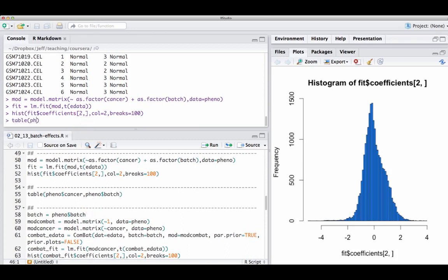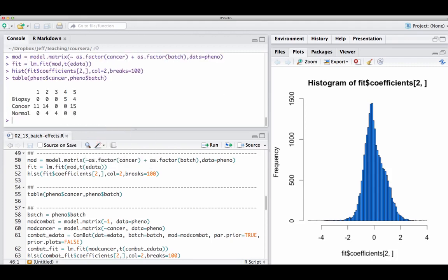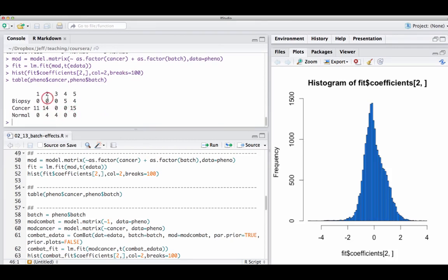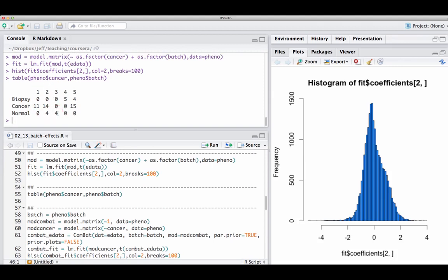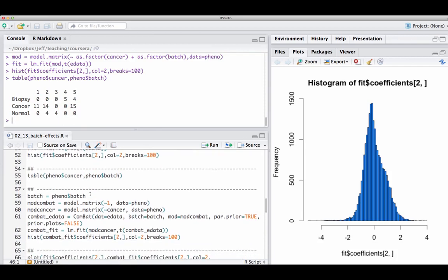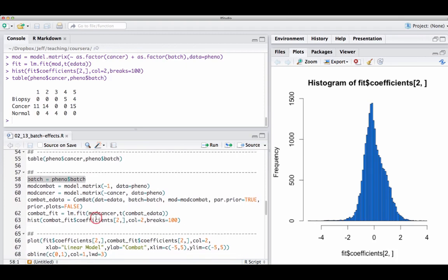One thing to be careful of is if there's a tight correlation between the batch variable and the outcome variable you care about. Ideally, you'll have balance within each batch — observations from multiple different groups. Here it's a little tricky because, for example, the fourth batch only has biopsy samples. Fortunately, they're not perfectly confounded: the fifth batch has both biopsy and cancer samples, and the second batch has cancer and normal. But if all cancer samples are in batch one and all normal samples in batch two, none of the adjustment methods will work. You have to be careful about that at the experimental design stage.